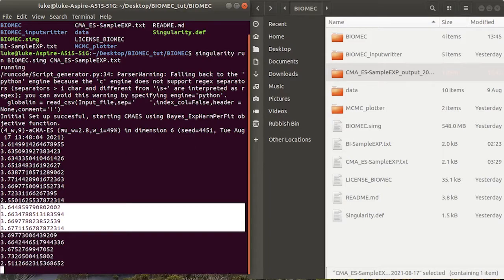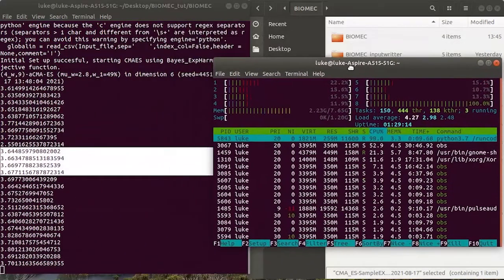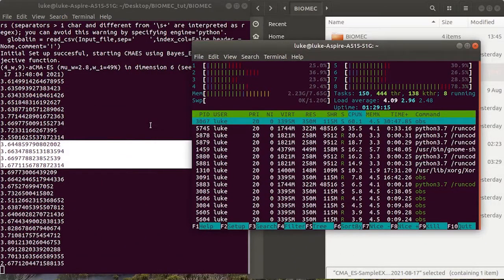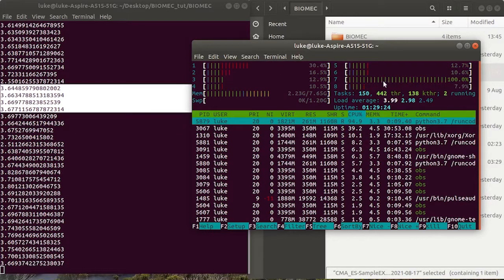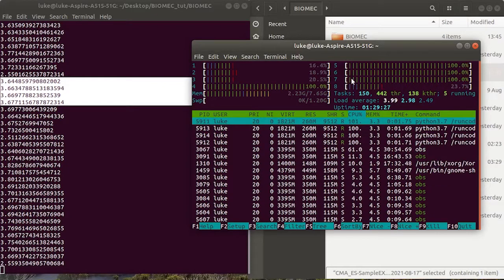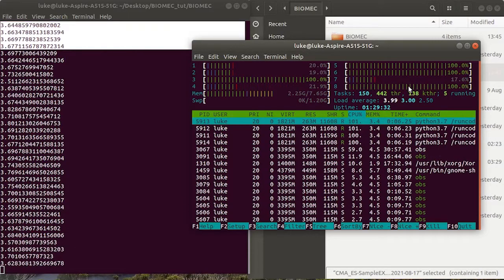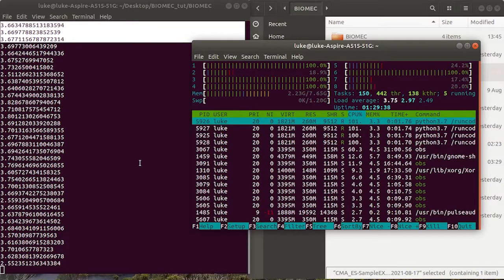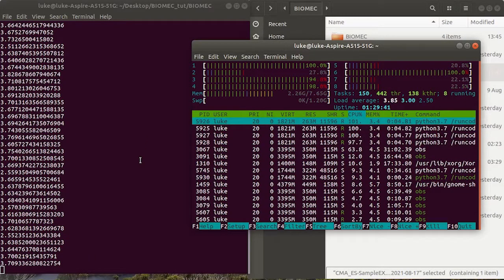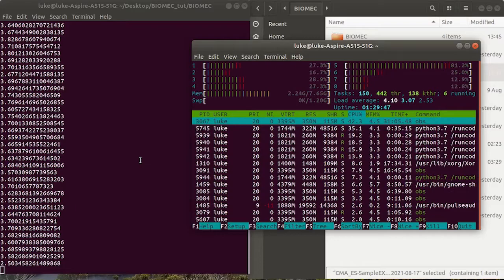If I quickly get up my new terminal for use, all simulations in MECSim generally max out the CPU's threads quite a lot. So I recommend not using all of your threads, but probably enough. There's a good balance. Here we can see that it's doing batches of 9, so it goes 4, 4, 1. So it's probably wasting a bit of time there because it just does 1. You could probably bump it up to 5, and that would speed everything up and optimize a lot faster.